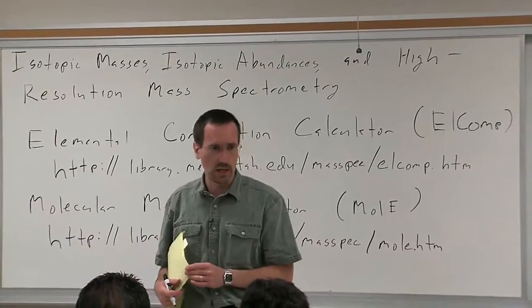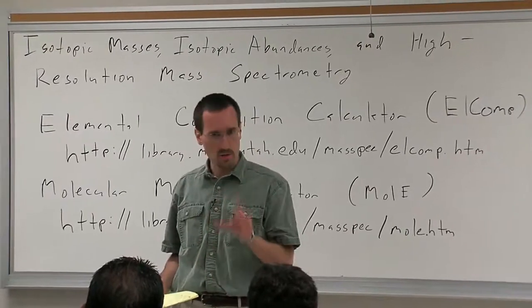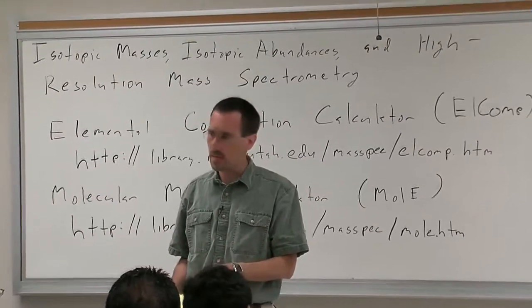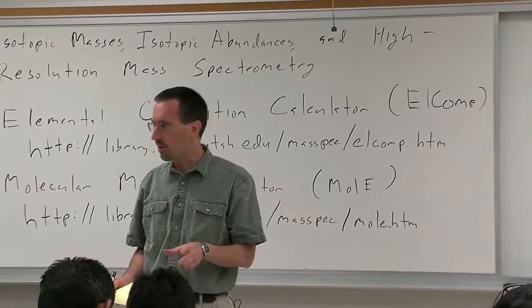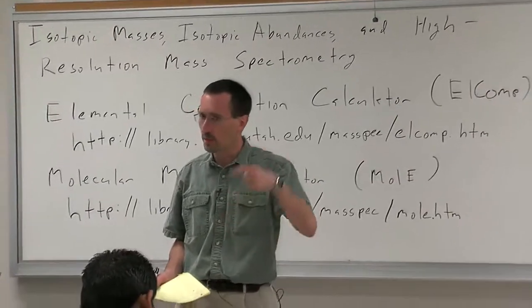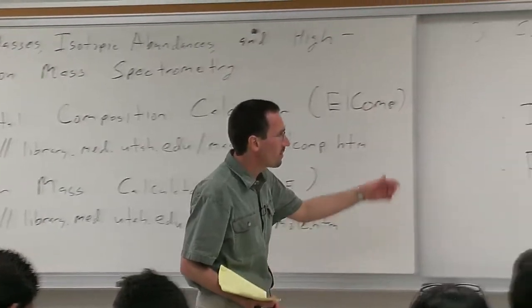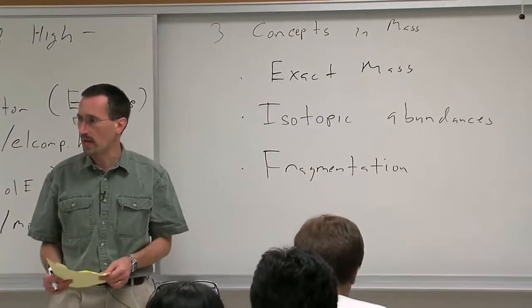We already saw in electrospray ionization last time an example of fragmentation of a quasi-molecular ion of a protonated species. Remember the type of molecular ion you get from soft ionization chemistry. And that's essentially just protic acid chemistry. What we saw was a reaction that involved a leaving group of protonated nitrogen leaving. That's chemistry that you've really been used to since your sophomore year. But when we talk about fragmentation in EI mass spec, we'll be talking about fragmentation of radical cations.